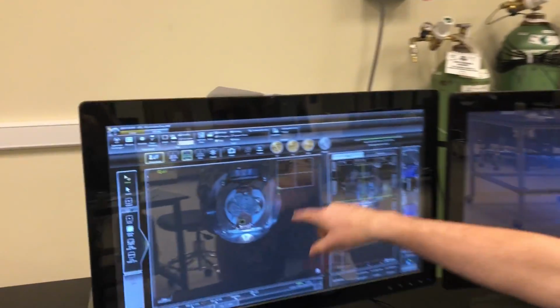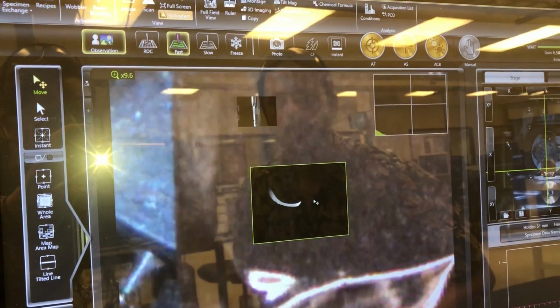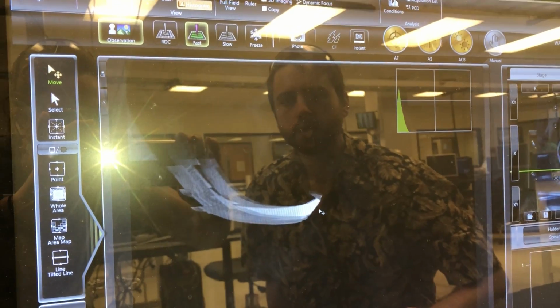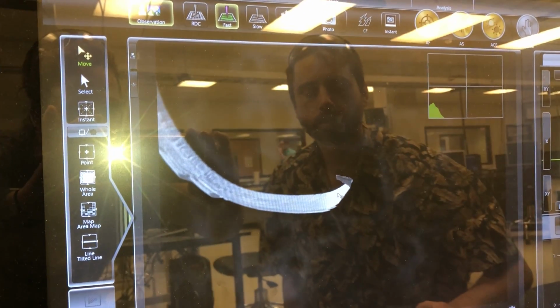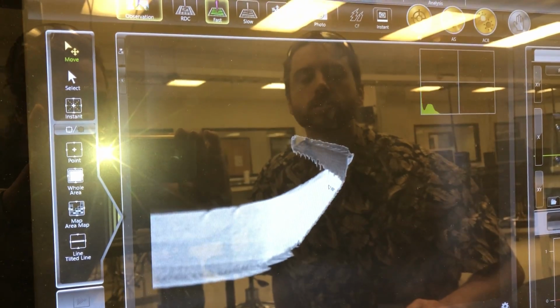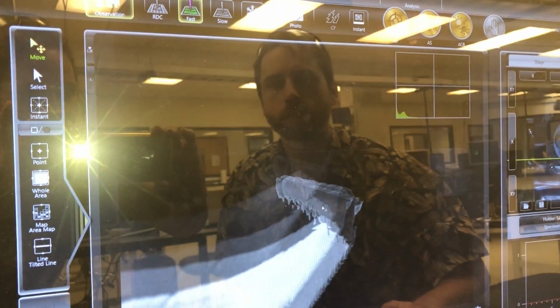Over here on the screen, here's just an optical regular photo of our tin sponge, but as we zoom in, this is the electron image that we're starting to see, seeing different places on this whisker of tin that's grown out from the sponge. And we can zoom in and start to see structure that you couldn't tell was there with your eye or even with an optical microscope.